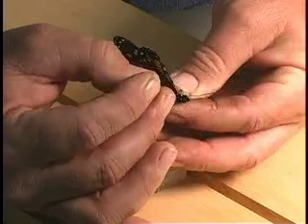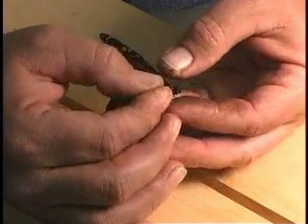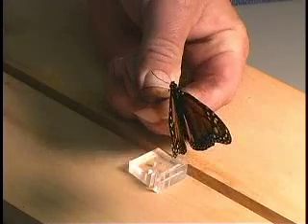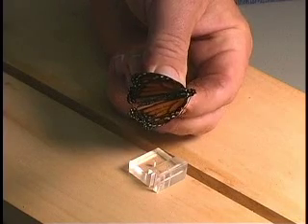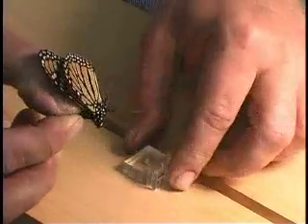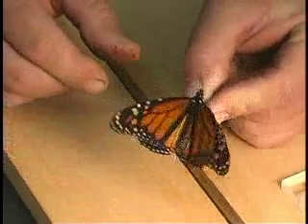Try to center the pin as close to the center of the thorax as possible. Push it all the way through till you can grasp the pin from underneath. And then you can look at the insect from the front and from the side to see that the pin has been inserted straight. If it's crooked going through the insect, then it's difficult to get the wings properly mounted on the spreading board.